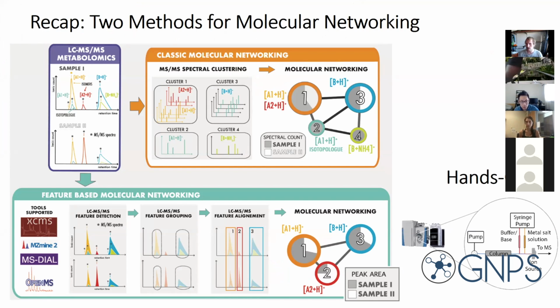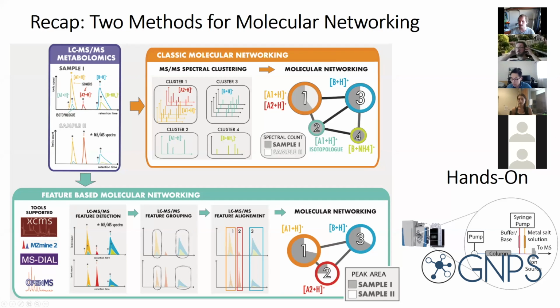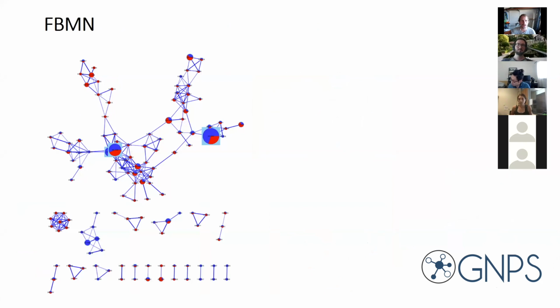We gave you a little hands-on task last week to mine native mass spectrometry data, where we infused metals post-column. Hopefully we made the point that we can now induce metal binding for siderophores in that data set, but those compounds were located at different spots inside of the molecular network.